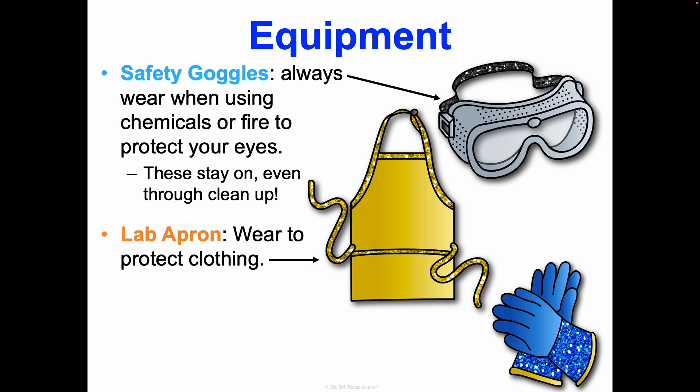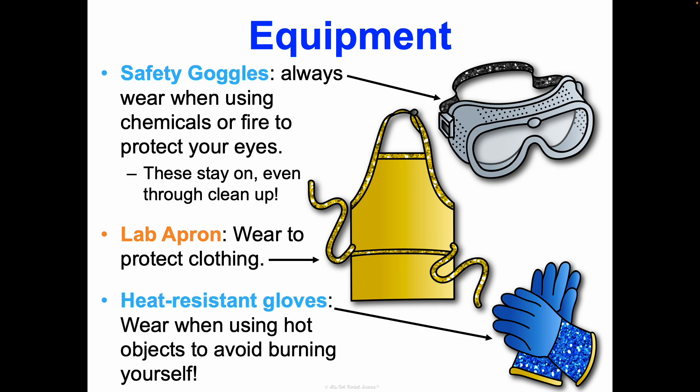A lab apron is what we wear to protect our clothing from chemicals or anything else we may be working with. Heat-resistant gloves are important too — if we're using hot objects, we wear these so you don't burn yourself. We also have non-latex rubbery gloves that can be worn as well, but those are not heat-resistant. Each lab, I will make sure you have what you need to do the lab safely. What's important is that you wear the things when they're given to you.